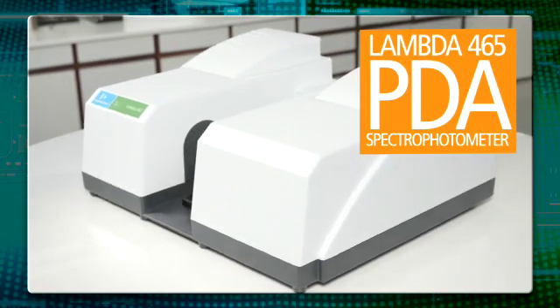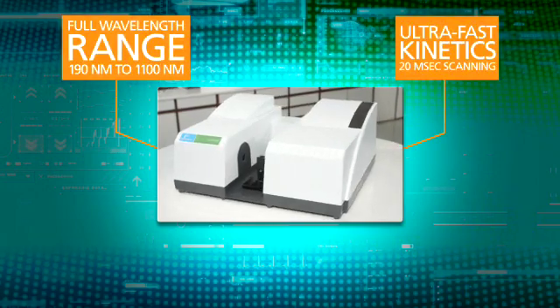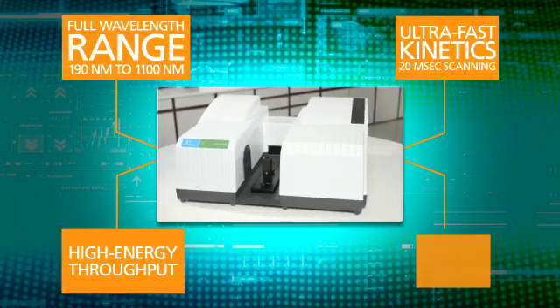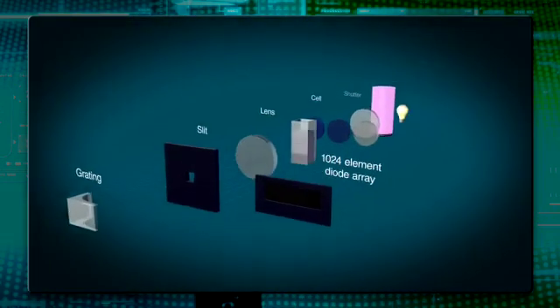The Lambda 465 is a high-performance photodiode array spectrophotometer that delivers fast, accurate, reliable results that you can have confidence in. Take a closer look at what makes our approach so effective.